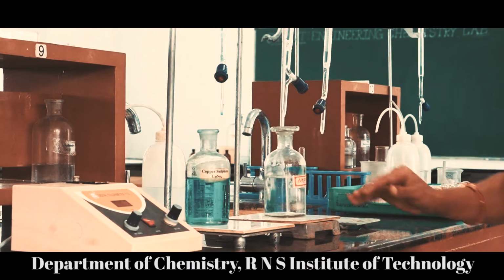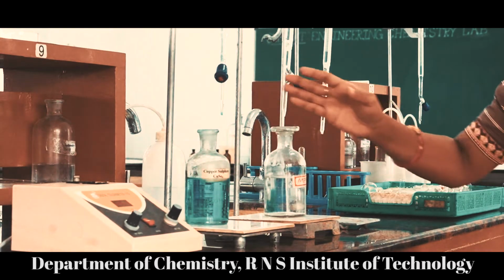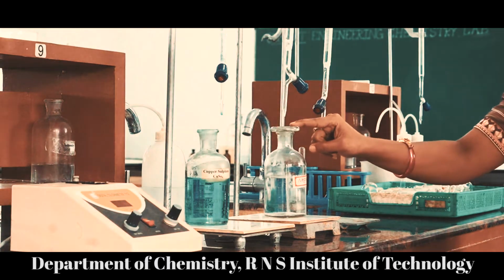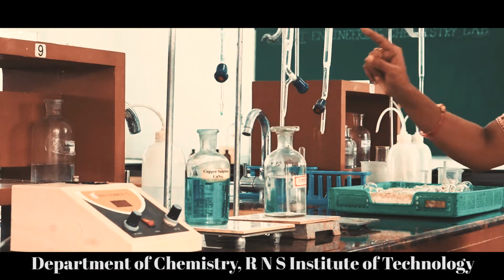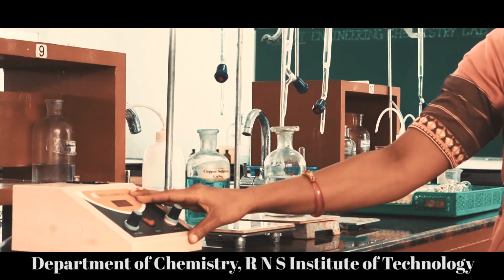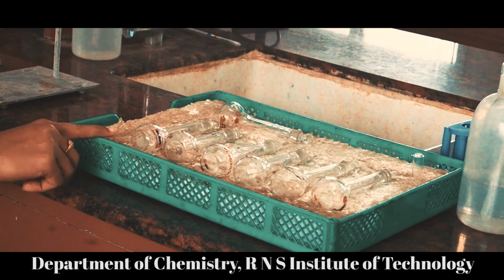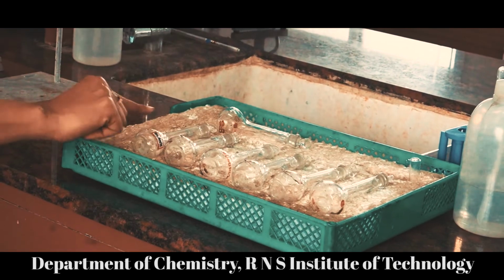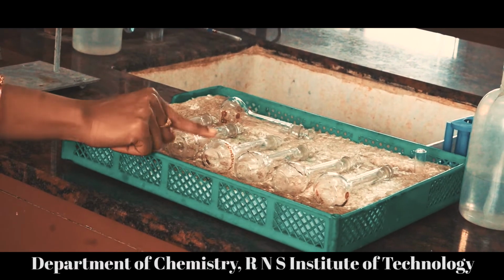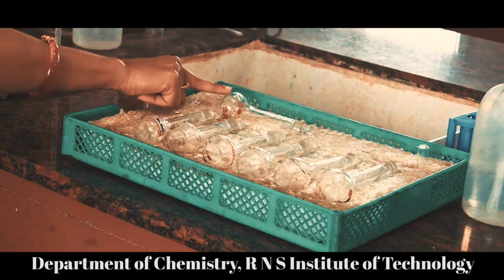We want 3 different solutions for our experiment: copper sulfate, ammonia or ammonium hydroxide, and distilled water. We are using a digital colorimeter for our experiment. To prepare our standard solutions, we are taking 7 volumetric flasks of 25 ml. These flasks are numbered as blank, 2, 4, 6, 8, 10 and unknown.